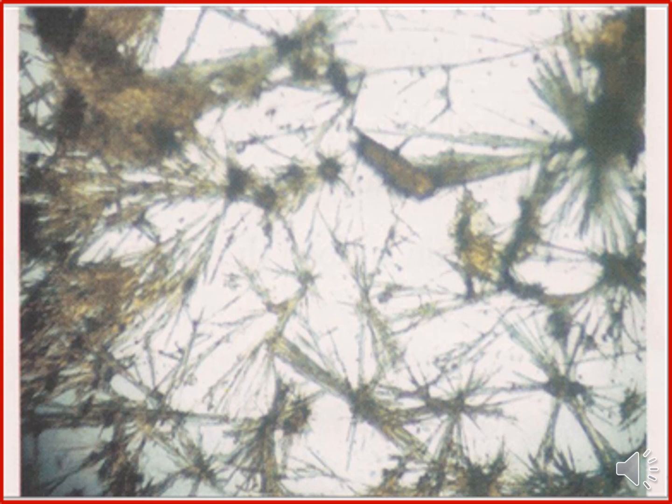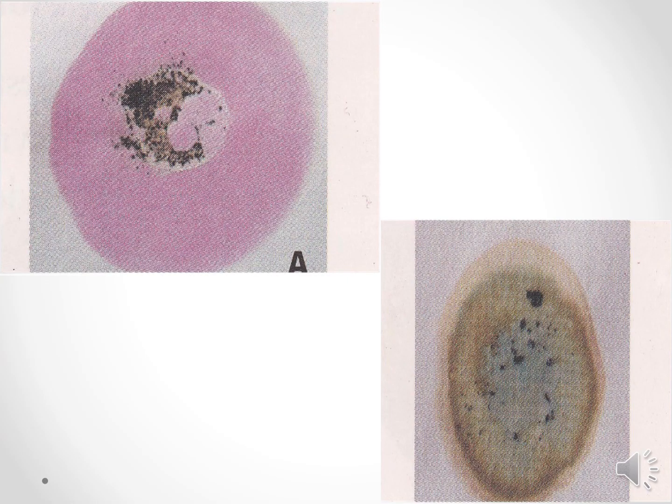Revision. What is this? Positive Barberio test. The stain may be semen. Above, positive phenolphthalein test. The stain may be blood. Below, positive guaiacum test. The stain may be blood. Positive Teichmann test. The stain is blood. Positive Takayama test. The stain is blood.